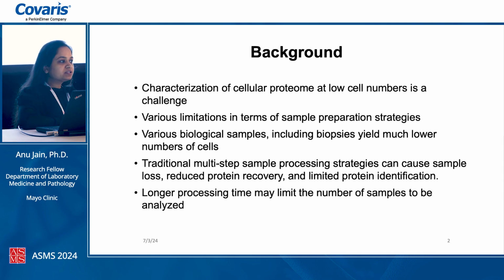And there are various biological samples where we may be limited by the starting amount of material, and the proteome analysis of these samples is of clinical value, such as biopsy samples or cells enriched for certain population of cells like immune cells enriched from whole blood cells, etc.